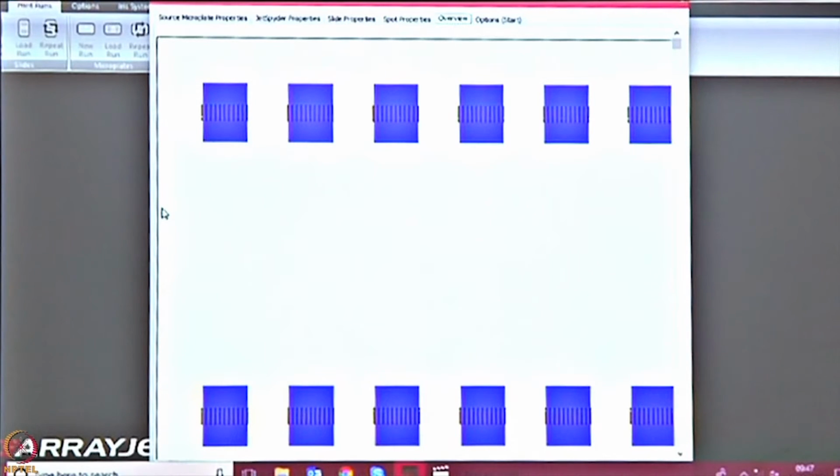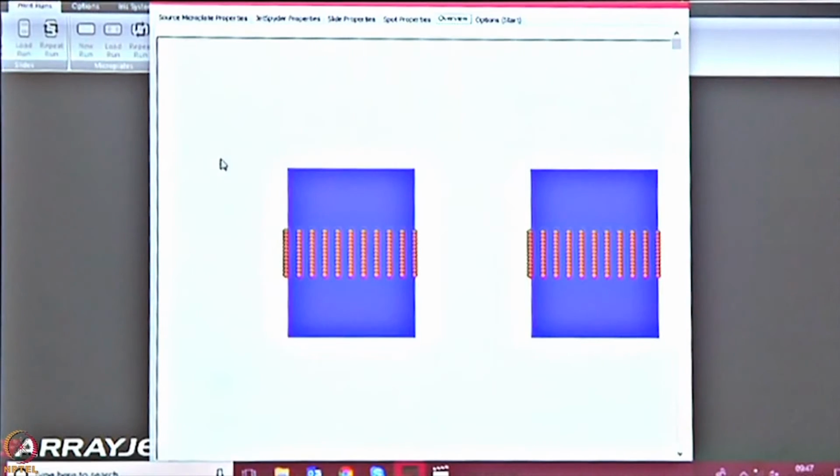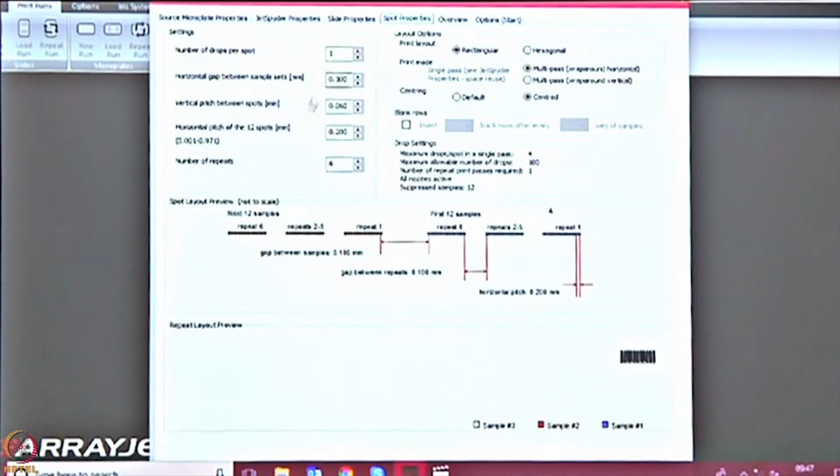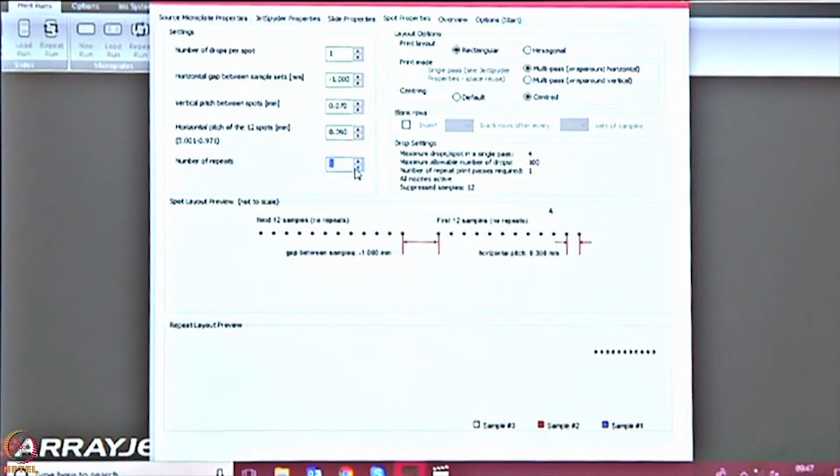So instead of doing separately, at the end of the day, you will have a complete data sheet which will show you my first spot. I'll increase the space because right now they are a bit clustered, so you can't appreciate it. I hope you're seeing this because it's not letting me increase it. And there is a reason, because it's reached its maximum limit.